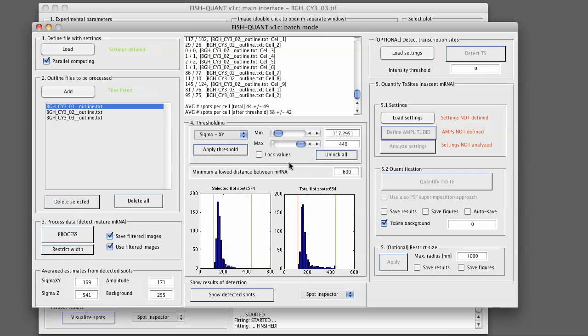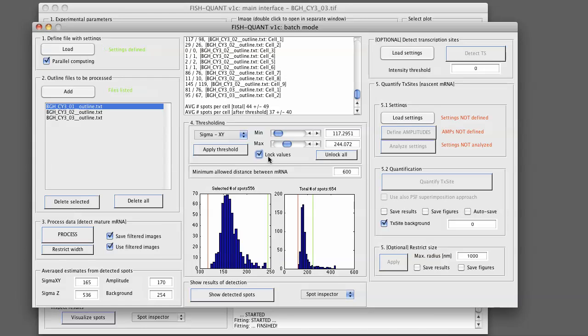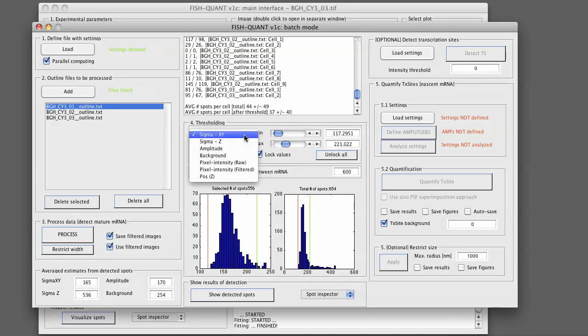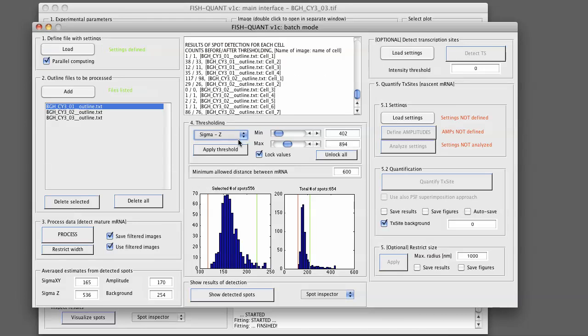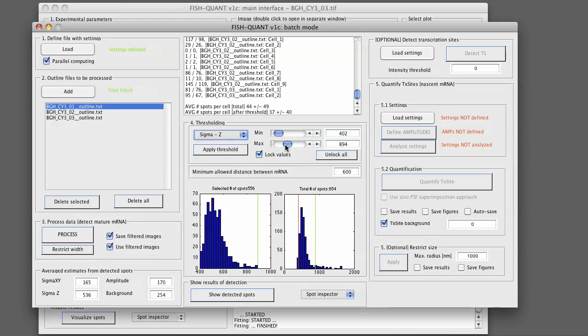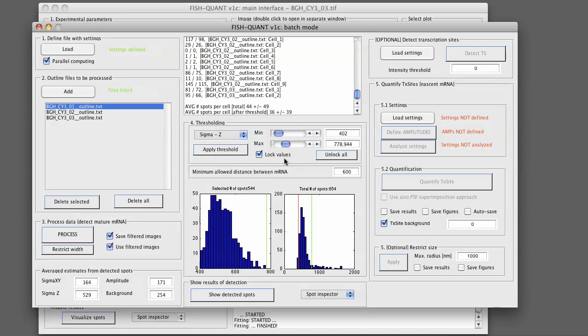Now we can perform again the same thresholding as before. So we can restrict the allowed range for sigma xy and sigma z and the other parameters. So we can set the upper limit for sigma xy, lock this value, do the same thing for sigma z.